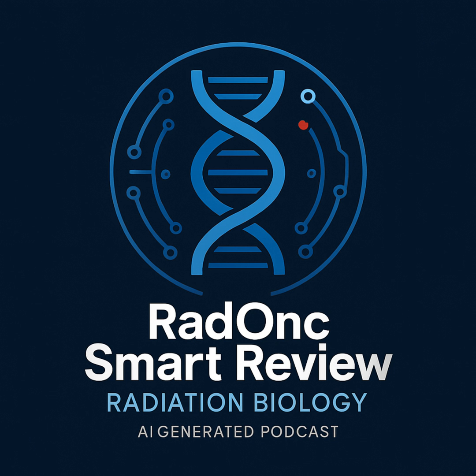Till and McCulloch. Right, focusing on blood-forming stem cells. Hematopoietic stem cells, HSCs, in the bone marrow. The method is ingenious, really. You take bone marrow cells from donor mice, maybe irradiated, maybe not. Inject a known number of these cells into recipient mice. But here's the trick. The recipient mice have been given a lethal dose of radiation first. To wipe out their own bone marrow, create space, an empty niche. Exactly. So the donor HSCs can potentially home to the bone marrow or the spleen.